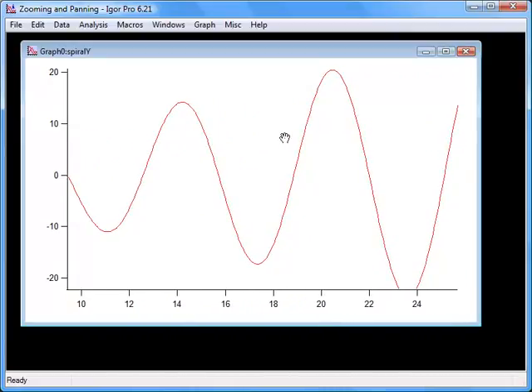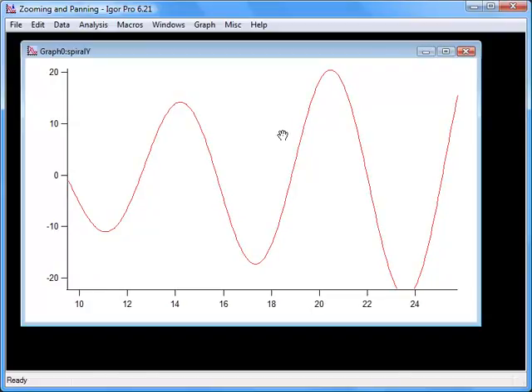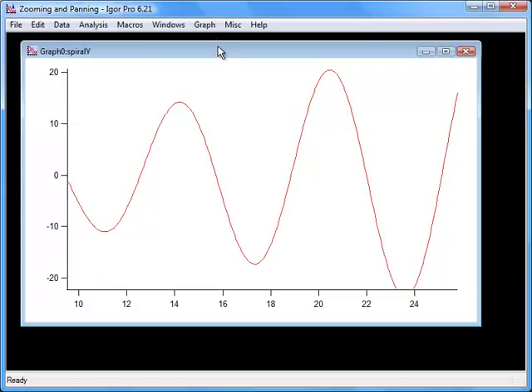To auto-scale the axis and recreate the original graph, choose Graph Auto Scale Axes.